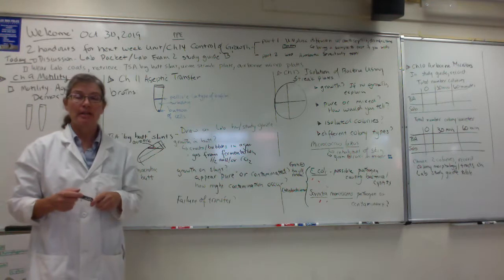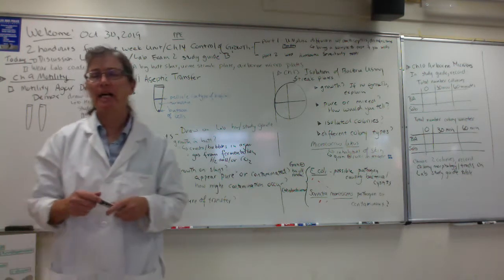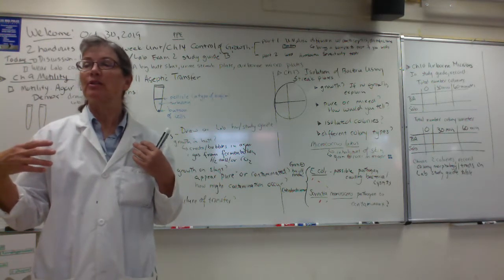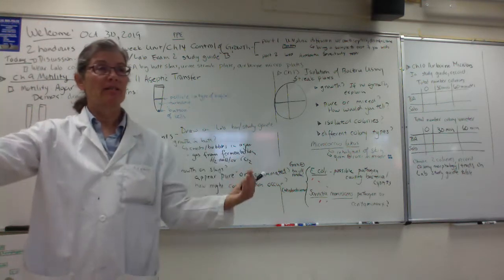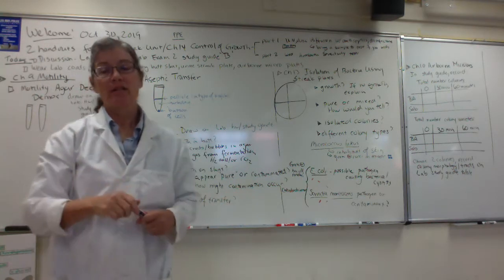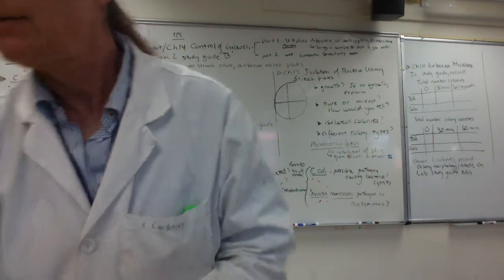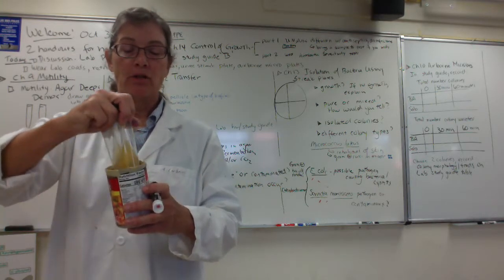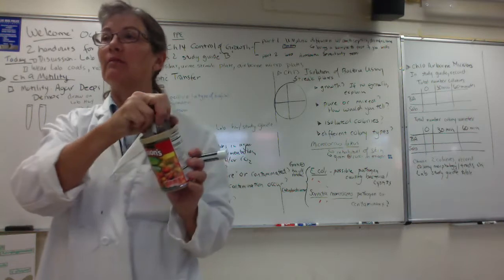One of the metabolic tests involves inoculating a big butt, what's called TSI agar. You'll see some of the microbes make so much gas, the agar literally explodes, right? One thing I forgot to mention, for safety's sake, whenever we're doing big butt slants, we should always put a paper towel in the bottom of our can and spray it with disinfectant.